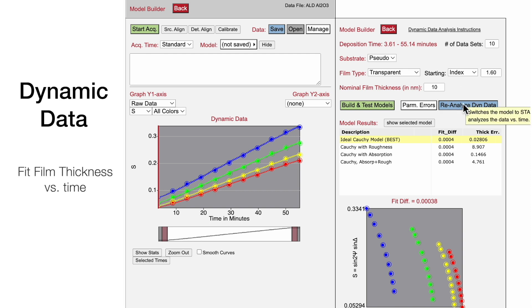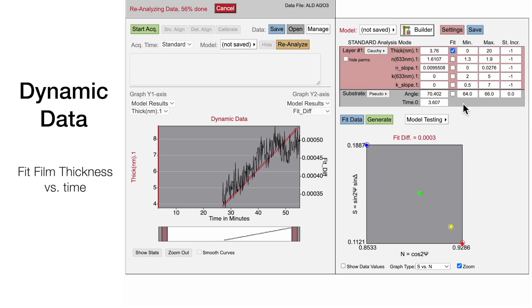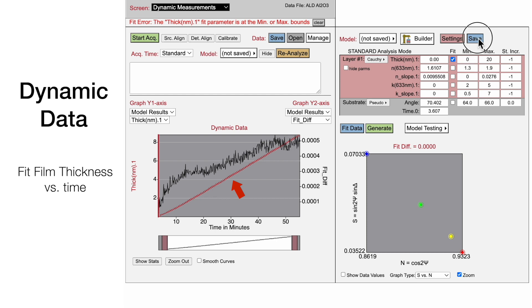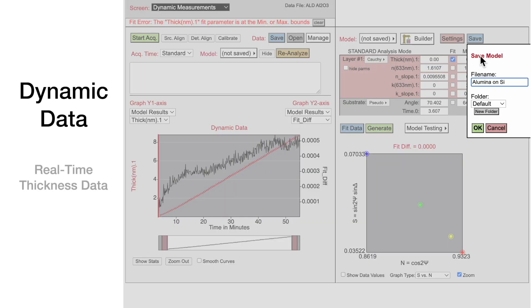Clicking the Reanalyze Dynamic Data button fixes the optical constant parameters determined from the multi-sample analysis and fits the film thickness versus time. The model can then be saved to provide real-time thickness data for subsequent deposition runs.